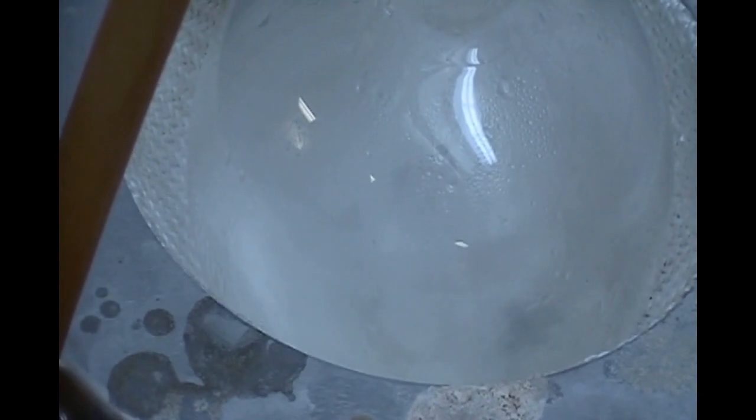Once the boiling began, we heated under reflux for 1 hour.